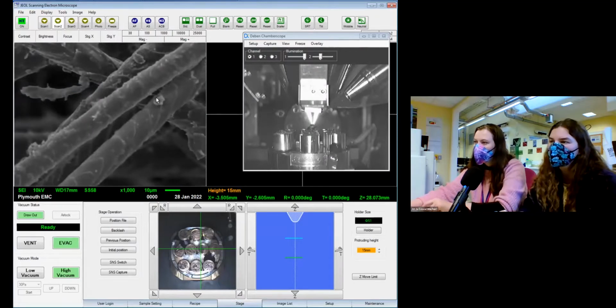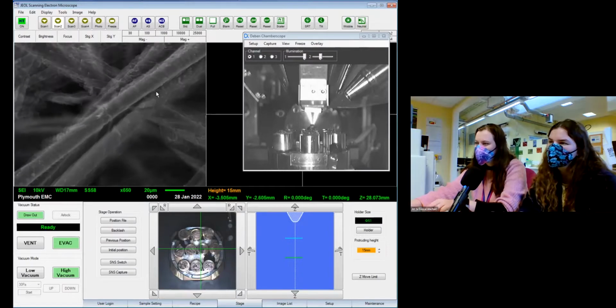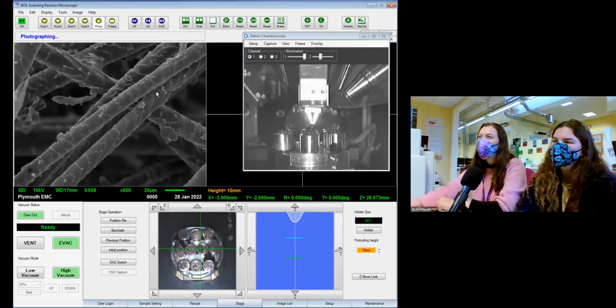I'd assume so. Similar sort of working breed dog, that fluffy outer coat. And that kind of leaf pattern on the outer hair. Kind of cool. You see lots of dust, which means he lives on a farm, so it's probably full of soil. Wouldn't be too surprised.